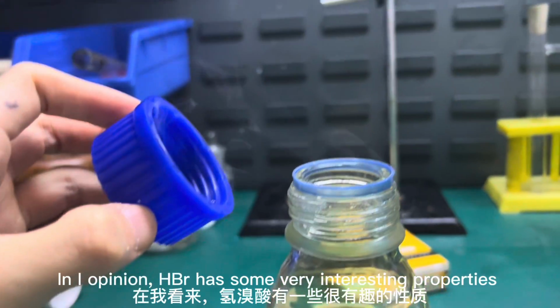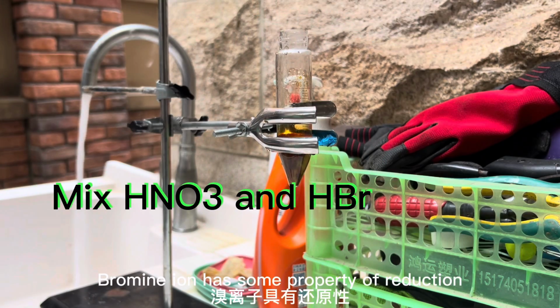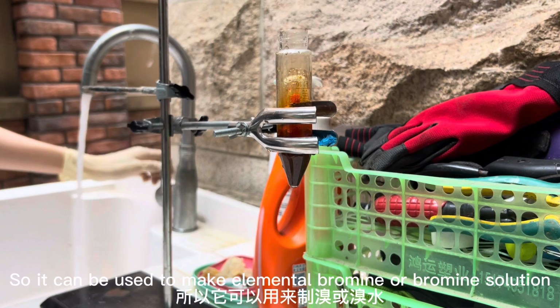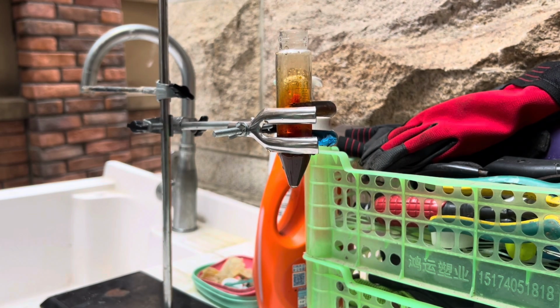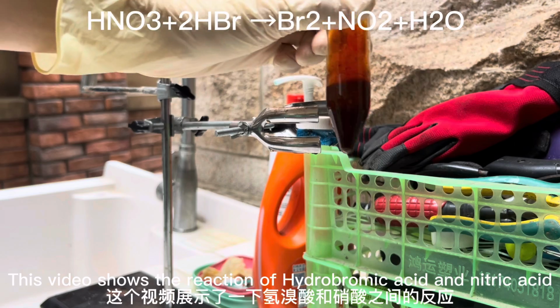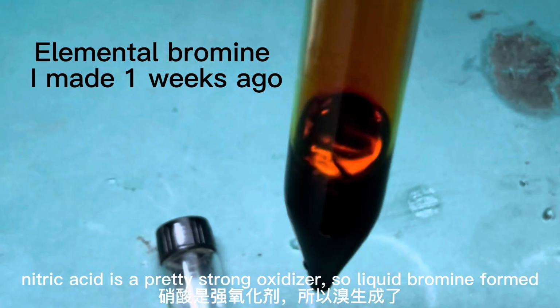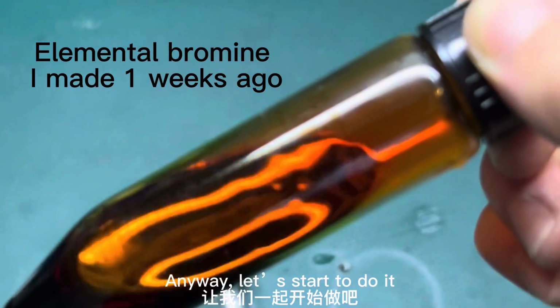In my opinion, hydrobromic acid has some very interesting properties. Bromide ion has some reducing property, so it can be used to make elemental bromine or bromine solution. This video shows the reaction between hydrobromic acid and nitric acid. Nitric acid is a pretty strong oxidizer, so liquid bromine is formed. Anyway, let's start to do it.